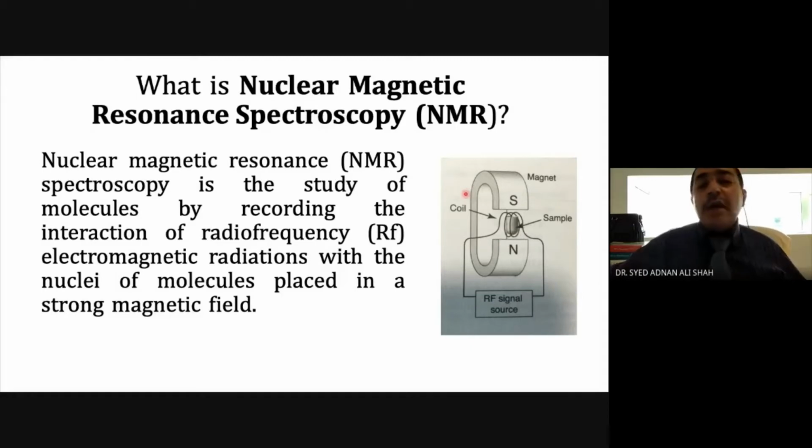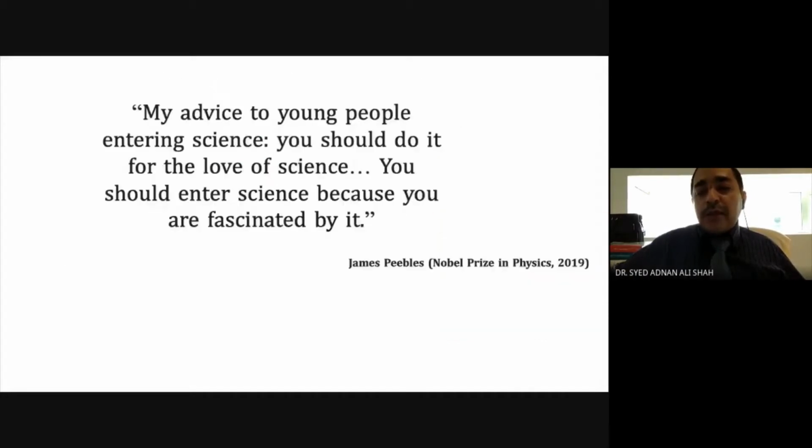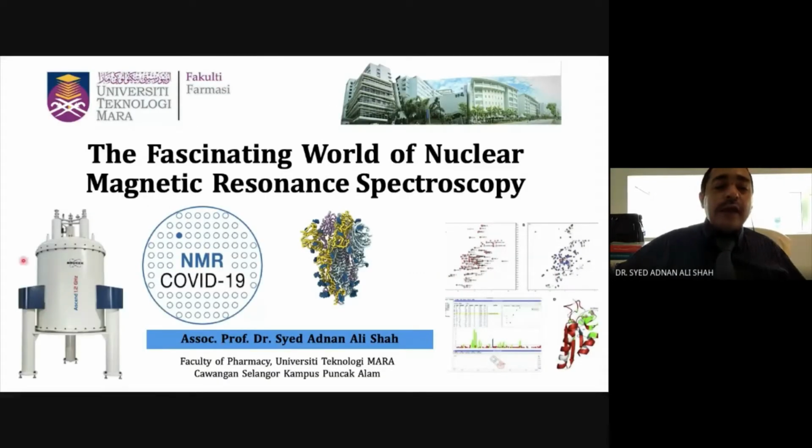It depends upon which nuclei you are interested in, whether the hydrogen, the carbon, or the nitrogen. You can easily analyze them with this instrument. So this is a brief introduction to how this spectroscopic technique works. As you can see, the instrument looks like this.